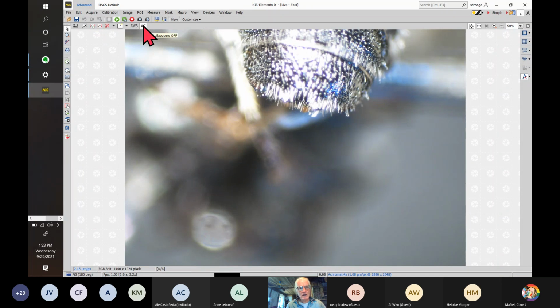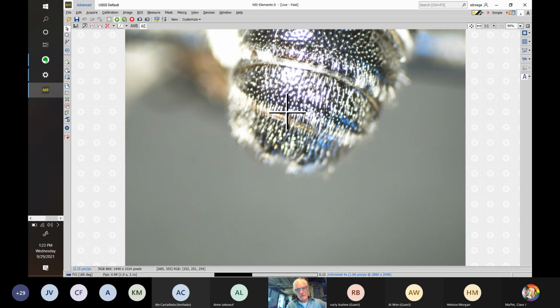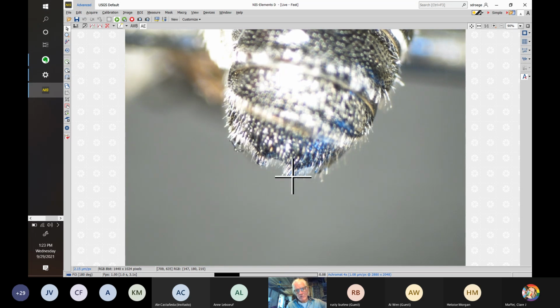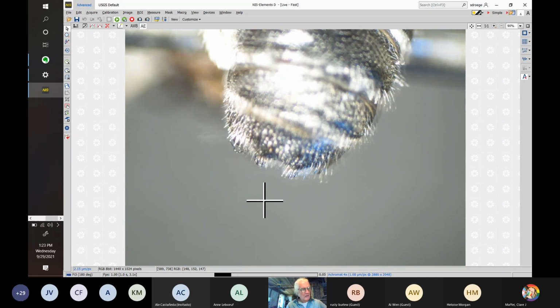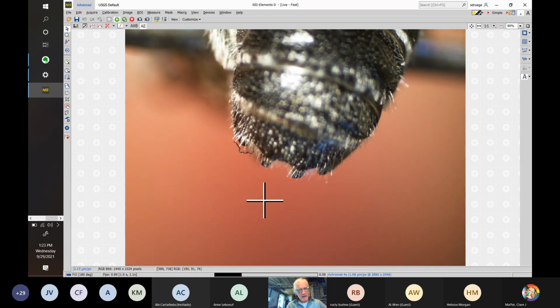Let's see if we can change the white balance. It doesn't seem to want to. Let me see if I can shift it a little bit so you can see through the hairs. That was actually pretty good for a second. This might be a slightly better view here. What we're looking for, yeah. So here are the projections. There's two on the far sides. These two central ones are more visible right now. Let's see if the trick of putting my finger below the specimen is helpful. A little bit. There we go. Oops, now you can see the teeth through the hairs a little bit better. So they have 4 in the back.